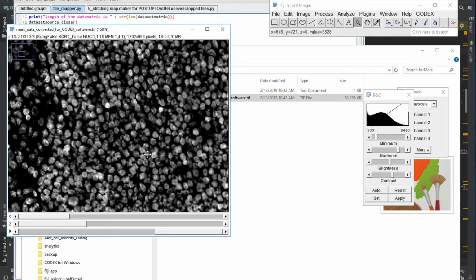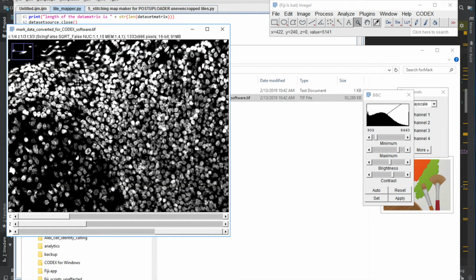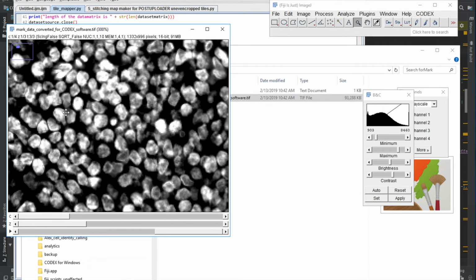What we could do is try to increase the multiplicator on the membrane coefficient. That might help. But this data looks pretty good to me, actually. I'm very sure we will get a good segmentation out of it. Yeah, I wouldn't process any further, right? Okay, let's see. Well, it does kind of clean it up.